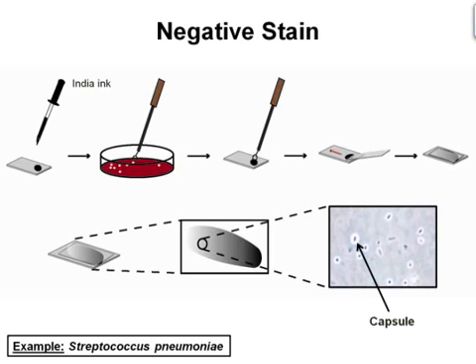First, place a very small drop of India ink on one side of the slide. Transfer a portion of a colony from the culture plate to the slide. Place the edge of a cover slip on the drop of India ink containing bacteria and gently slide the edge of the cover slip across the slide so as to create a concentration gradient of ink, and drop the outer edge so the slip covers the slide. The India ink should be spread across the slide in a thin layer. The smoky gray area of the stain indicated with a circle here is the area for viewing under the microscope.